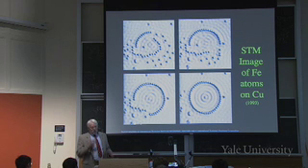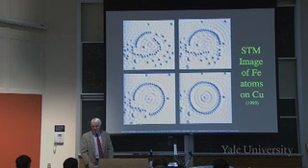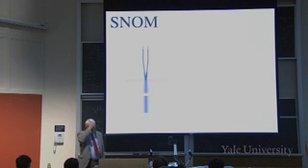Okay, so that's neat. So clearly you can see or feel individual atoms, right? But you don't see the bonds. The bonds are smaller. It just looks like a bunch of balls, right? You don't see the electron pairs between them. Here's SNOM.